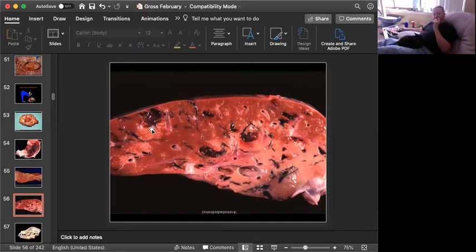There are some areas of hepatic lipidosis scattered through here in the area of the trematodes. A sick hepatocyte accumulates fat, especially if it is due to ischemic damage, oxygen starvation. We need oxygen to make ATP. ATP is important because hepatocytes can take in fat without expending any energy, but to repackage it and excrete it, to attach protein to it and re-excrete it into the blood, it takes energy. So sick hepatocytes tend to accumulate fat. They get big and swollen, but they don't release it. And in the areas of extensive trafficking by these parasites, you have ischemic damage, and the hepatocytes in these areas tend to become fat-laden.